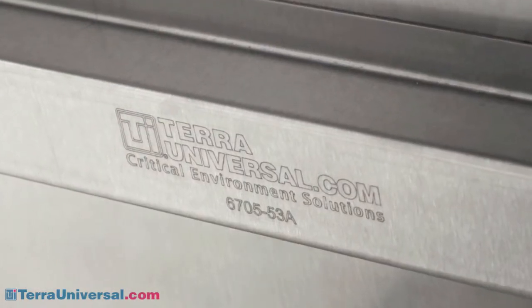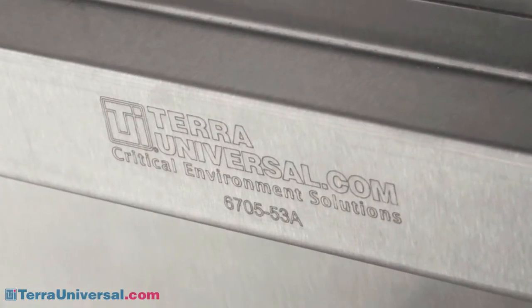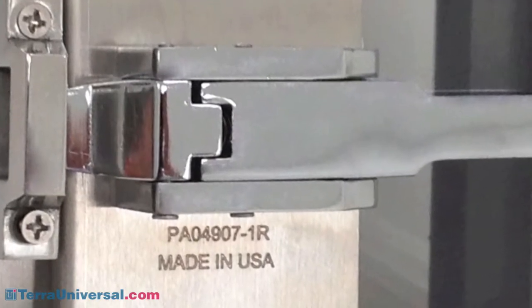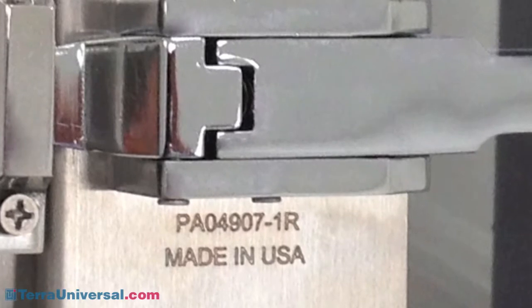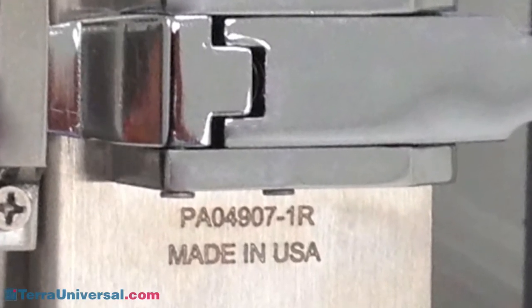Like other chamber hardware, each door is stamped with a Terra part number. If you ever do experience a problem, you can replace this or any other desiccator component with replacements shipped from Terra's stocked inventory.